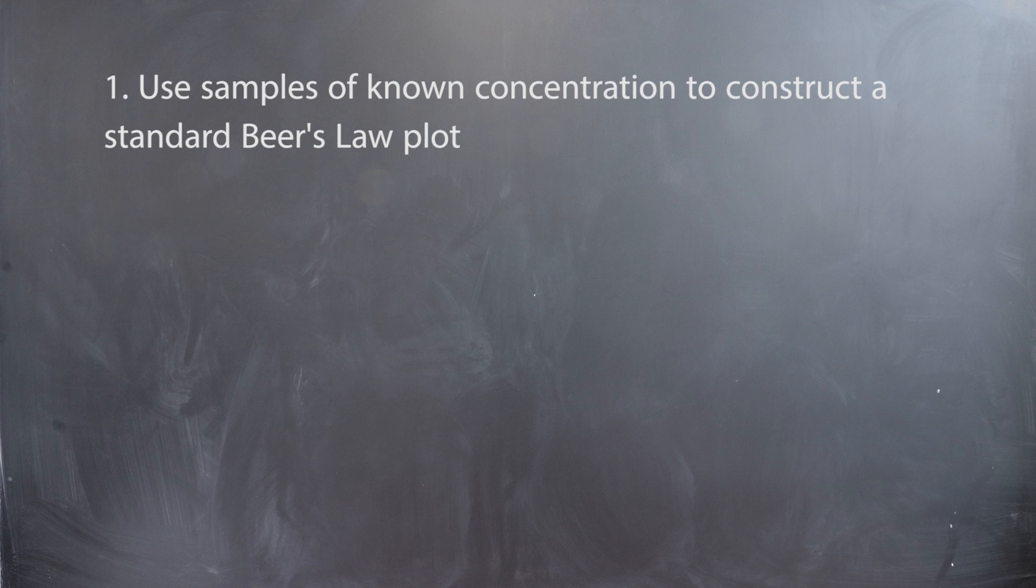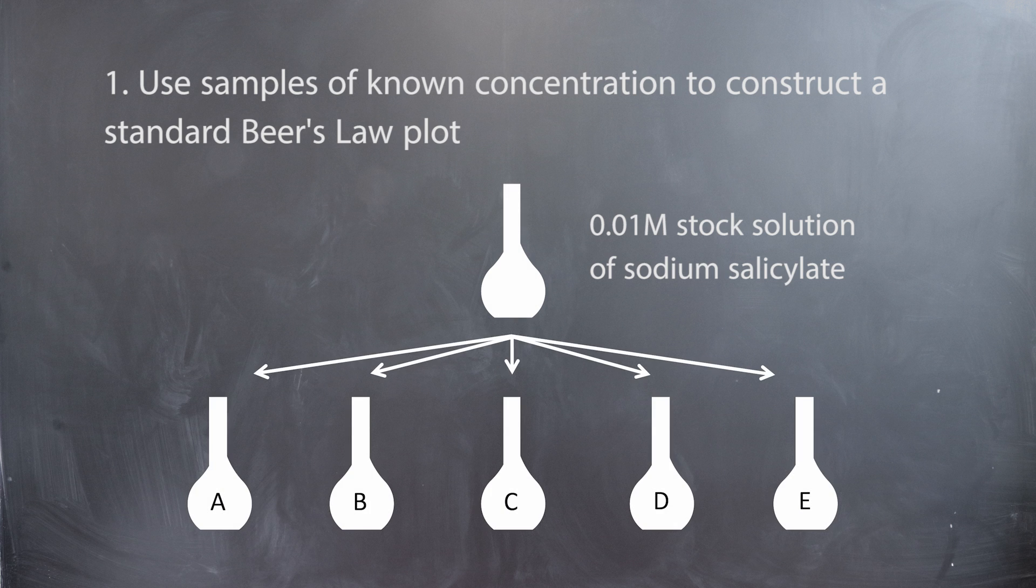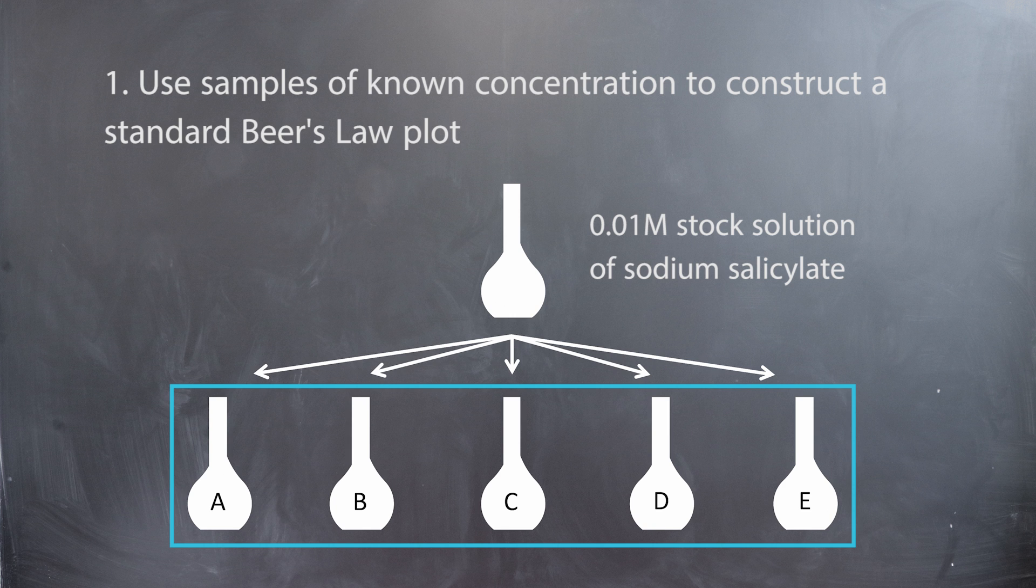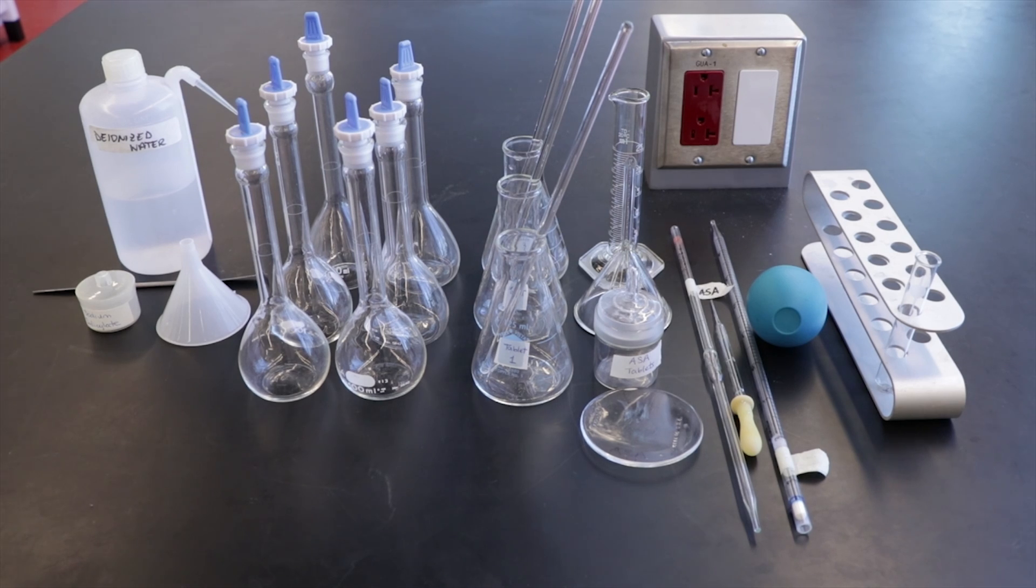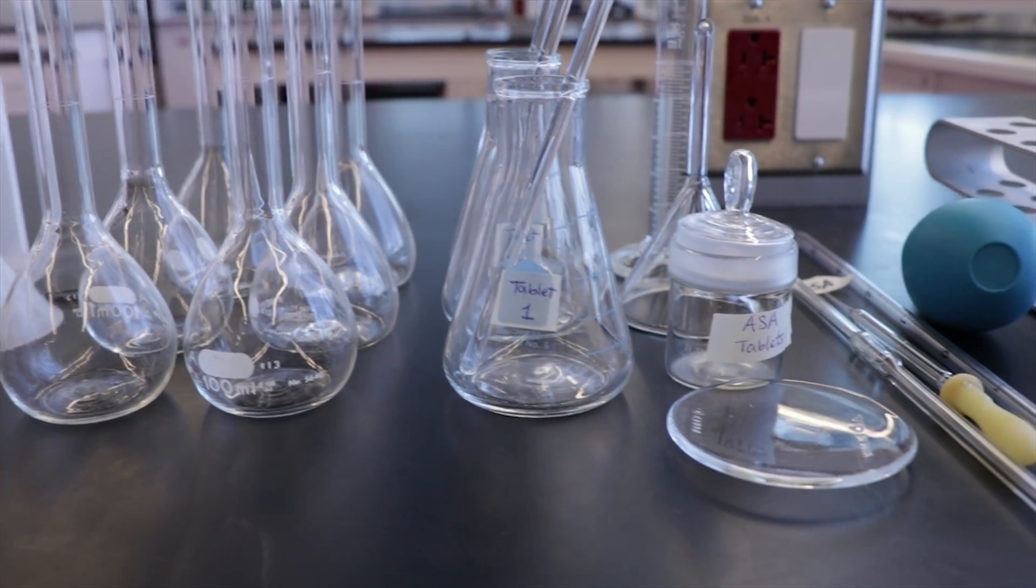In the first part of this experiment you will make a 0.01 molar stock solution of sodium salicylate and use that stock to make five standard solutions, A through E, which will be analyzed using the spec 20. This is the apparatus we will be using for this lab. Remember to label all the glassware to ensure that you are organized.